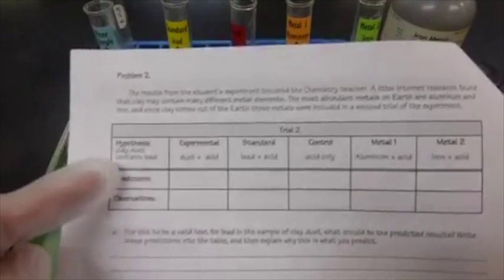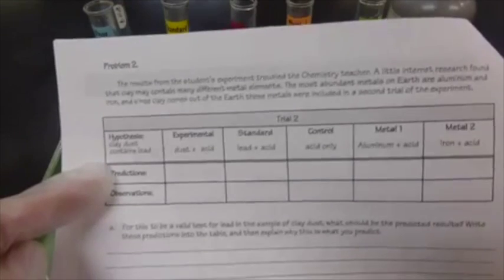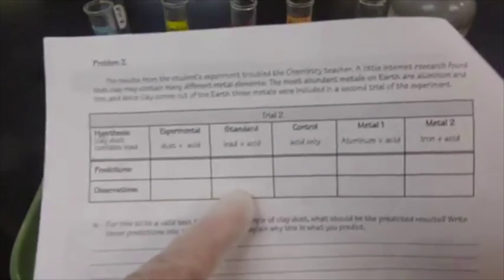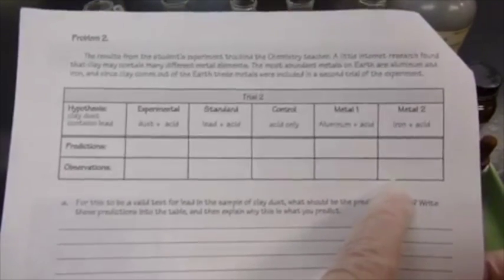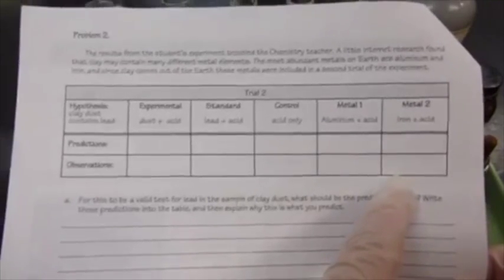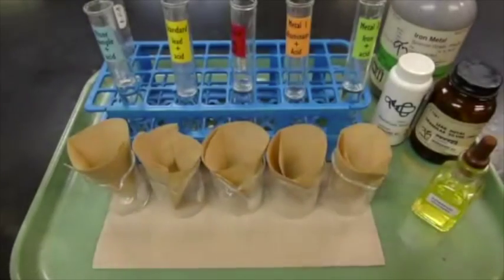of this experiment. The samples that are being tested: first, a repeat of the test for what's in the floor sample, and then a standard and a control, and two additional samples, aluminum and iron, because those are the two most abundant metals in Earth. So stuff that comes out of the ground has a high content of aluminum and iron. So let's take a look and see how the results turned out this time.